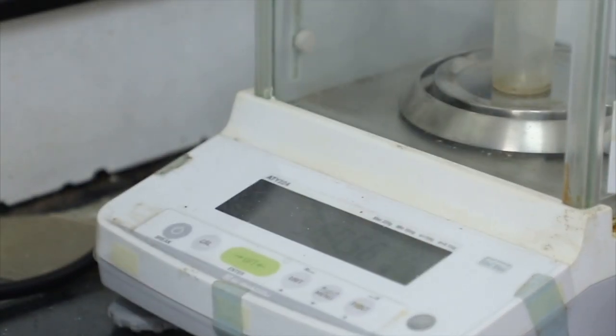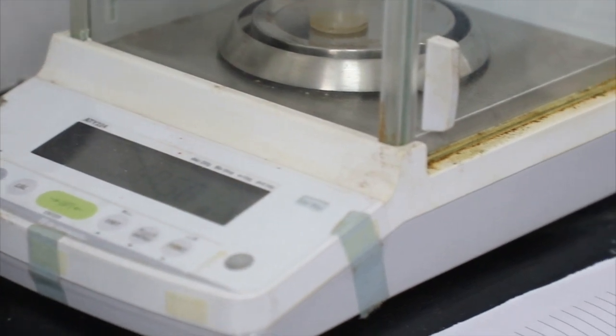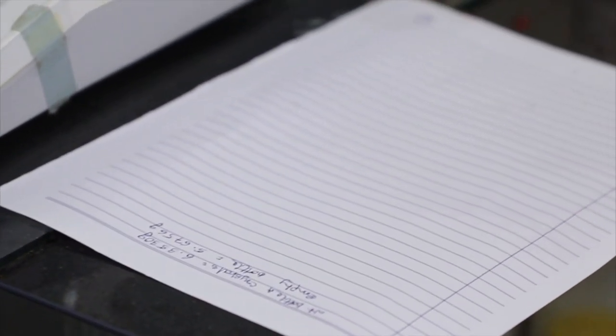The weight of the empty bottle is noted down, that is 5.6756 gram. So we now know the weight of the bottle plus potassium dichromate and the weight of the empty bottle. If you subtract the weight of the empty bottle from the weight of the bottle plus crystals, you will get the total weight of the potassium dichromate transferred inside.